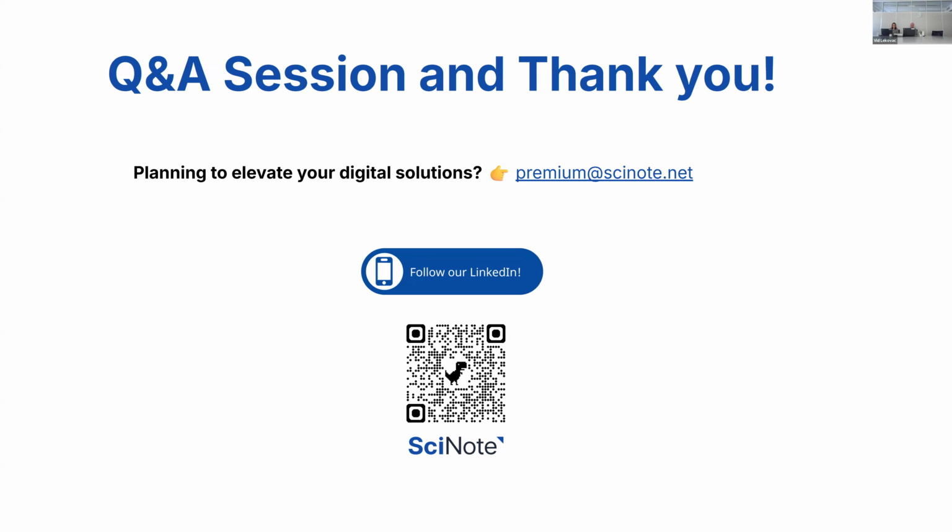But that's something I completely agree saves time. That saves a lot of time. How to use net stock in these consumption options. So, Mayur, as I mentioned earlier, we're going to follow up with you and make sure what exactly you're using, so what type of SciNote, and let you know how you can enable stock and then track consumption.